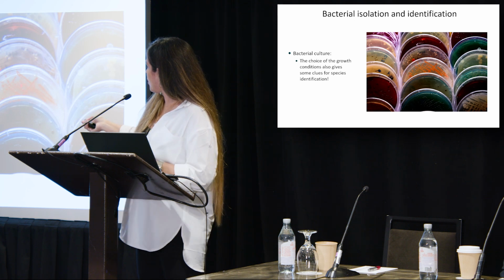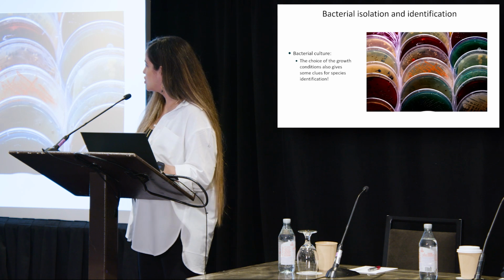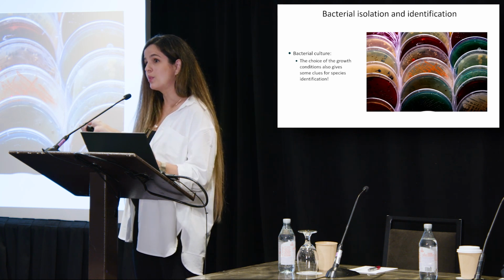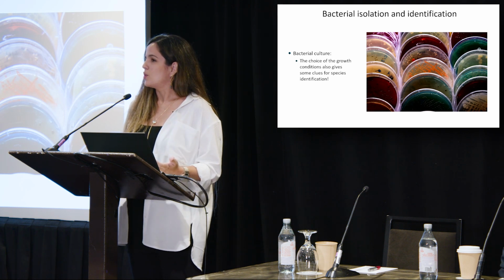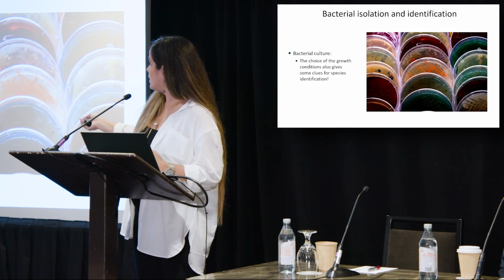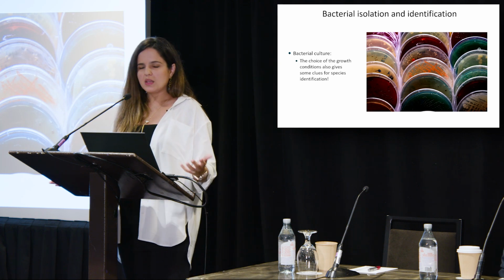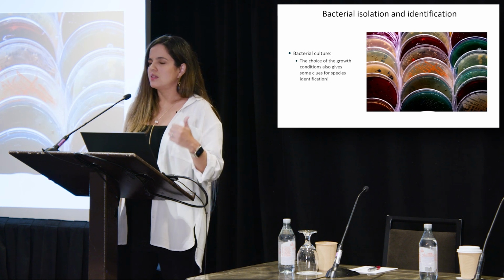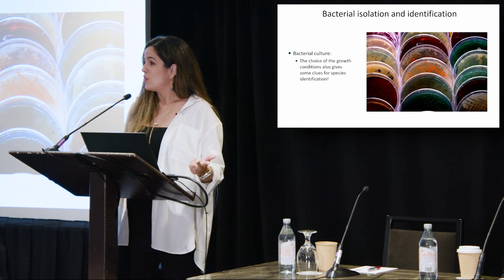And they have different colors and different shapes, and I will show a few more pictures to you, but all of the information that comes from this step can also help us identify these microbes. These colors mean a lot to us. So let's suppose this agar in the middle, we call Hektoen agar. The Hektoen agar is an amazing source of nutrients for pathogens such as Salmonella, that perhaps you already heard about, Shigella, Escherichia coli.